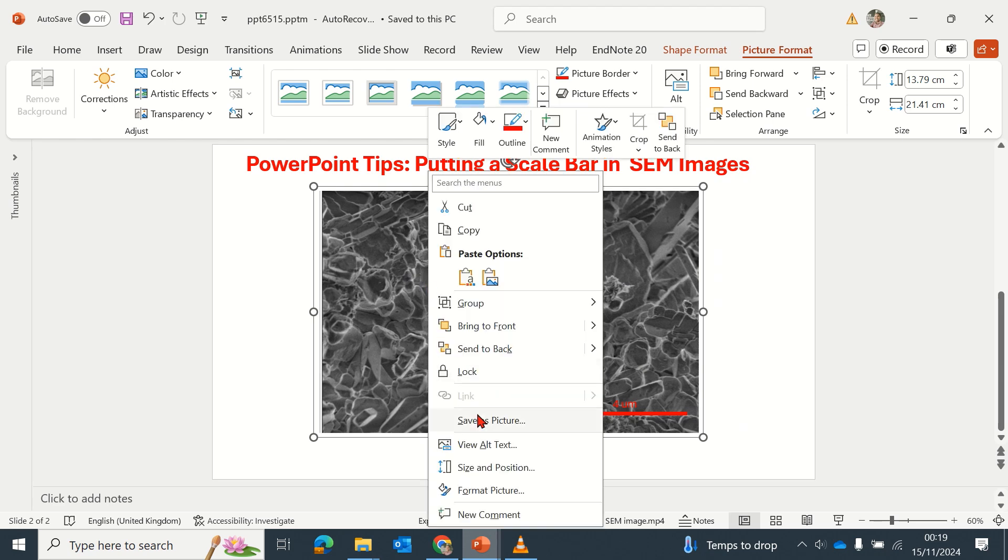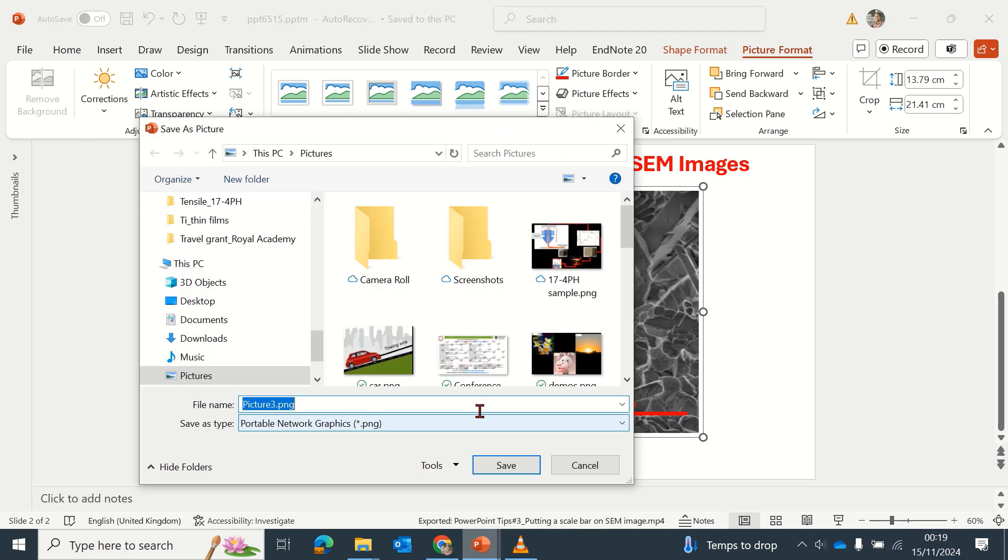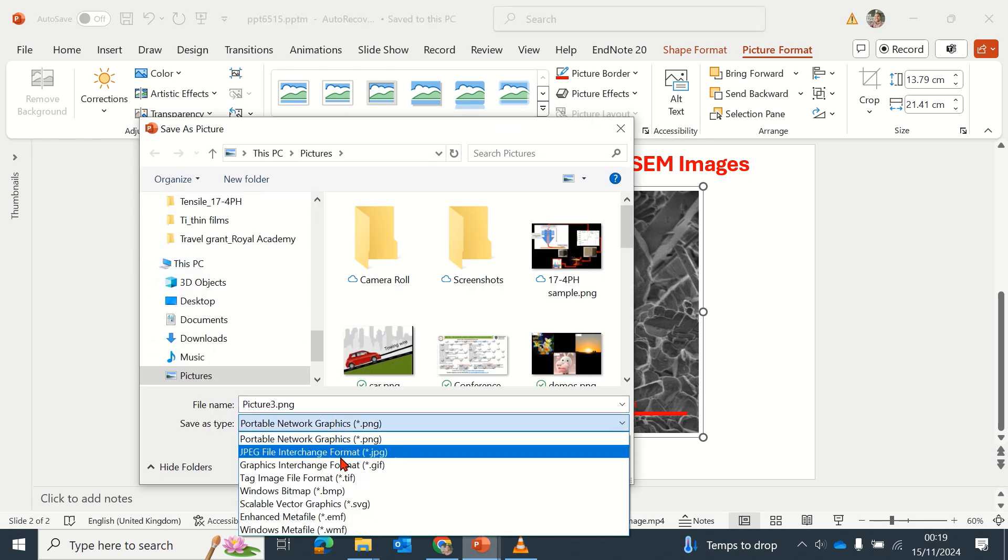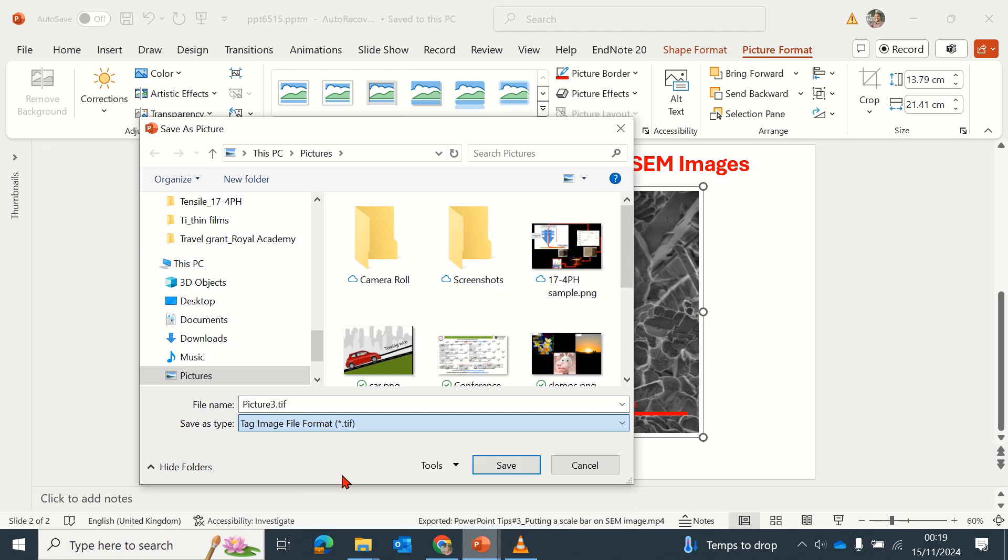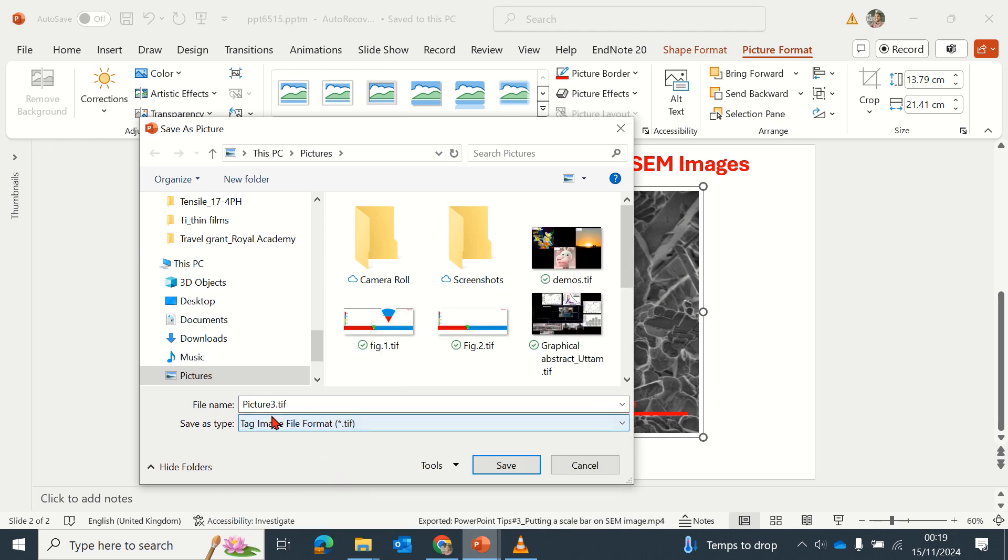And then you can just save it. I like saving as TIFF because TIFF maintains the quality of my images and it's light for my Word document report.